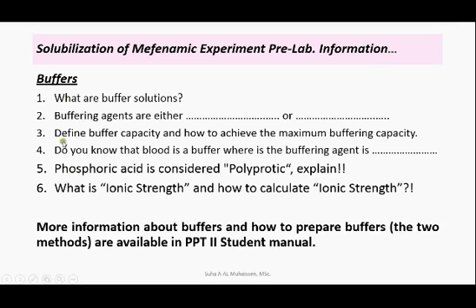The ionic strength of a solution is a measure of the concentration of ions in the solution. Ionic compounds, when dissolved in water, dissociate into ions. The total electrolyte concentration in solution will affect important properties such as the dissociation or the solubility of different salts. One of the main characteristics of a solution with dissolved ions is the ionic strength.